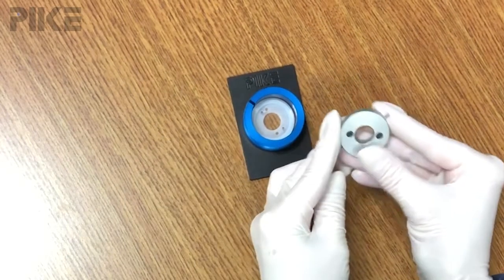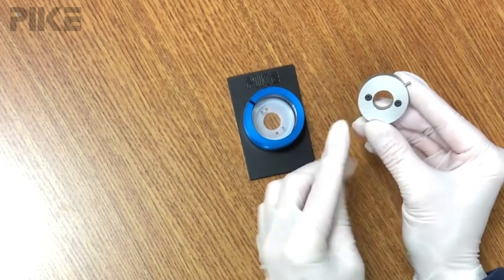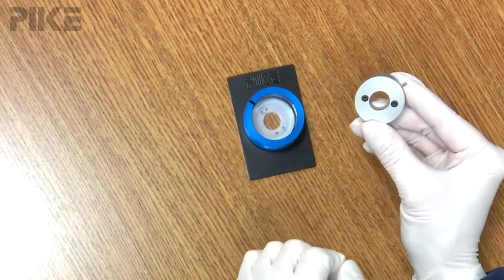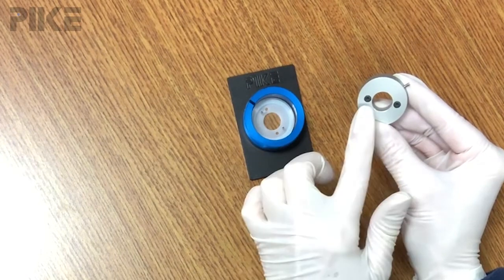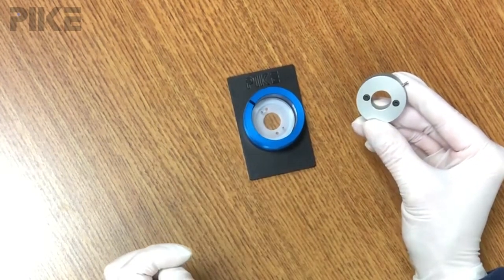In contrast, the o-ring seal version relies on small perfluoroelastomer o-rings to seal between these filling holes and the drilled holes on your infrared window.